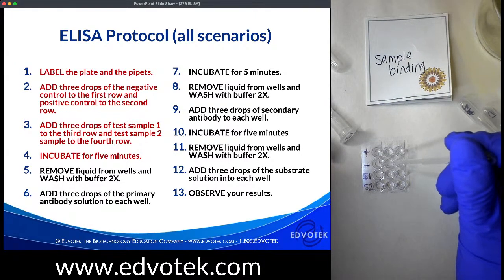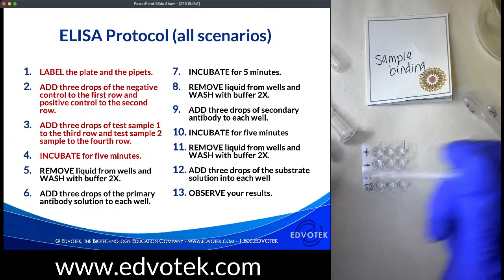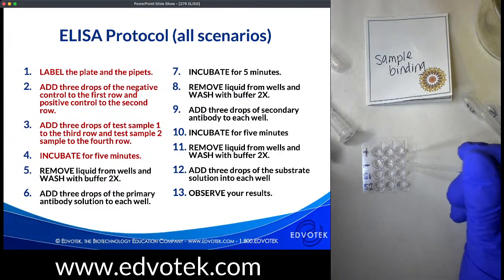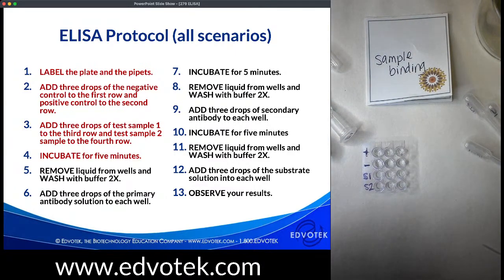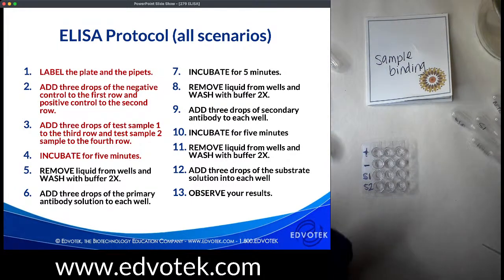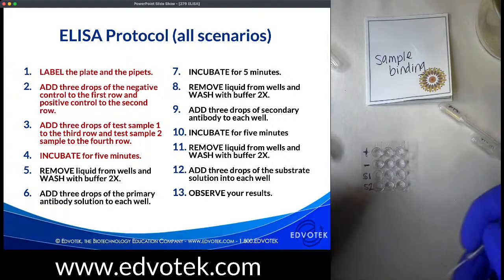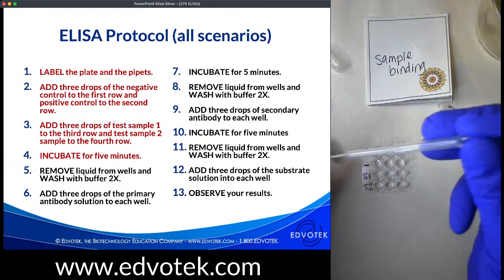This sample should not contain any antigens if I did my homework correctly, and if I don't cross-contaminate anything, which is, of course, always a possibility. Experimental error is a big part of life in science. And sometimes we have to try things multiple times in order to get consistent, reproducible results without contamination.